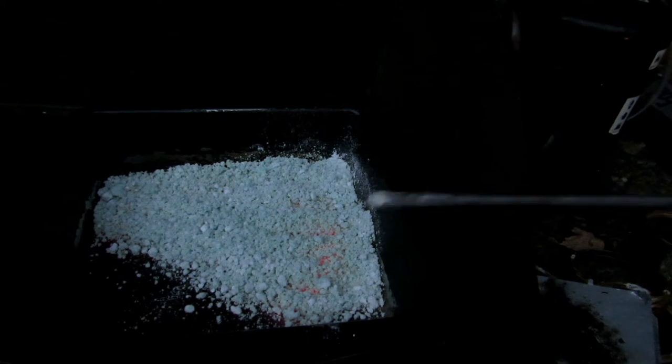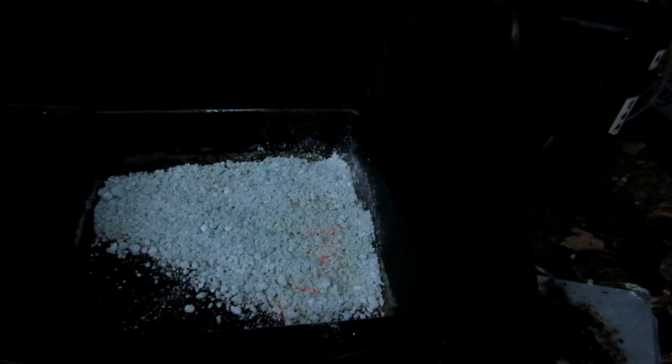We'll continue to let this decompose. You can see some white chunks in there — those chunks haven't reacted yet, so you'll have to break those up. I'm just using a simple iron rod, because sodium hydroxide when molten will dissolve glass, and we wouldn't want to ruin a glass stirring rod. We'll just let this react for another five minutes or so. It appears not to be hardening into a solid chunk, probably because we started with powdered ingredients.